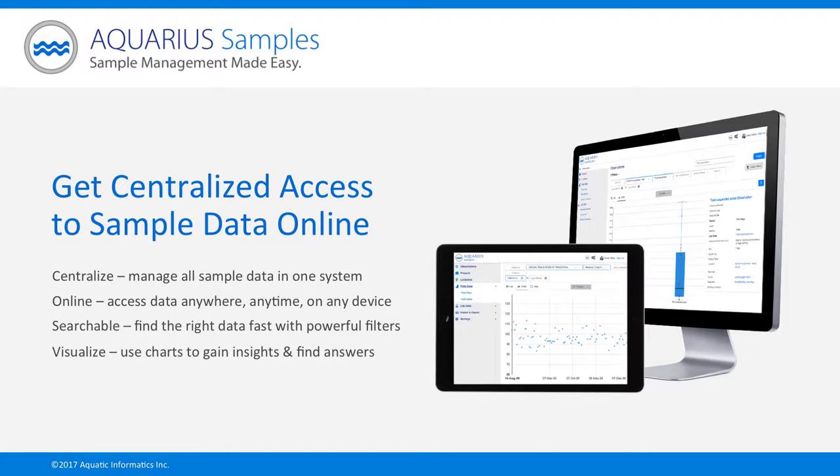In this Aquarius Samples video, I will show you how to securely access all of your lab and field sample data online. You'll see how all discrete data of any kind, including water, air, soil, biological, and tissue data, are available for rapid search, analysis, and visualization, so you can make better decisions anytime, anywhere. Let's start by looking at observations.